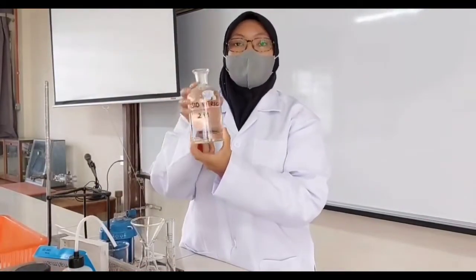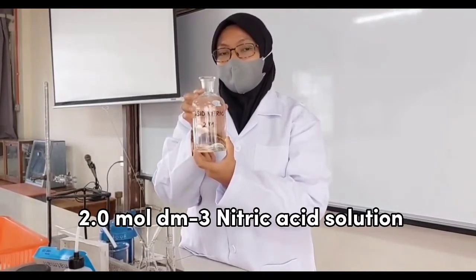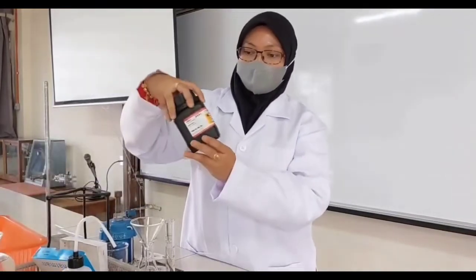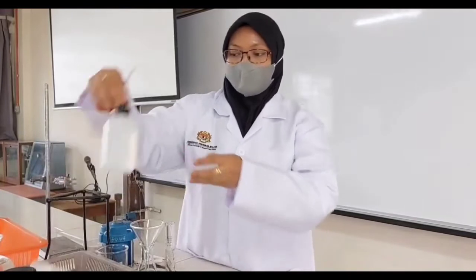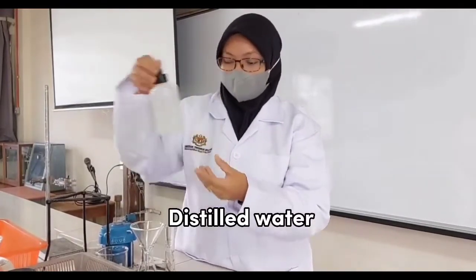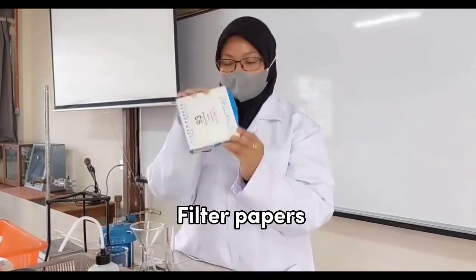The materials that we are going to use in this experiment are 2.0 mol per decimeter cube of nitric acid solution, copper 2 oxide powder, distilled water, and filter papers.